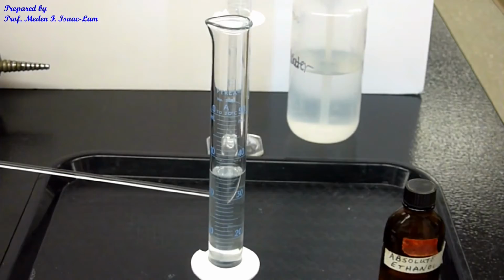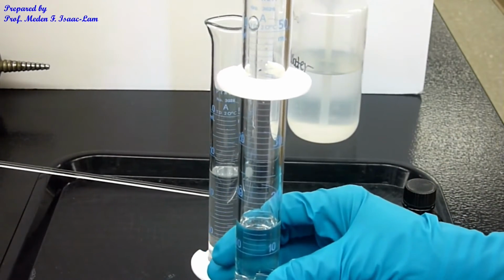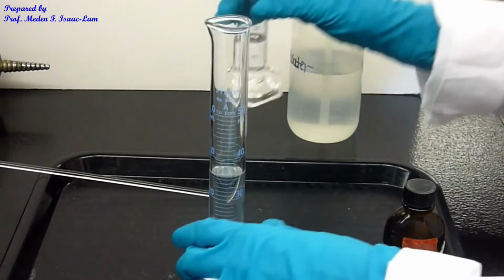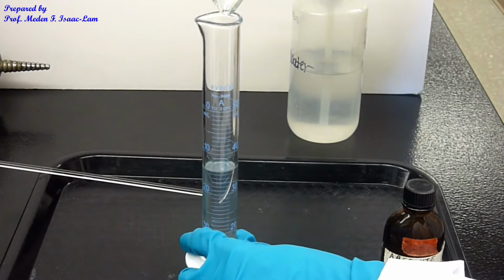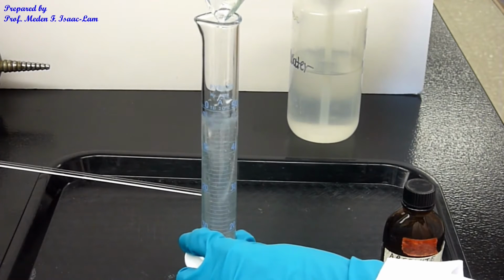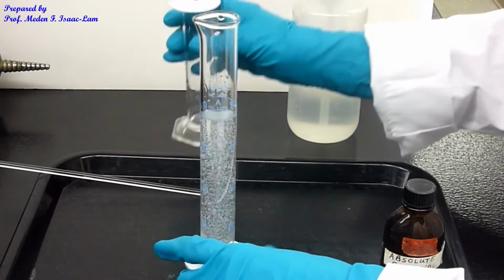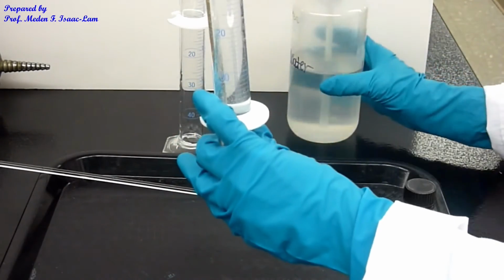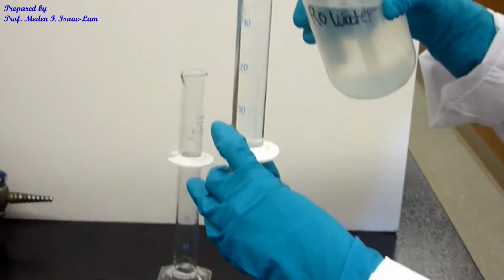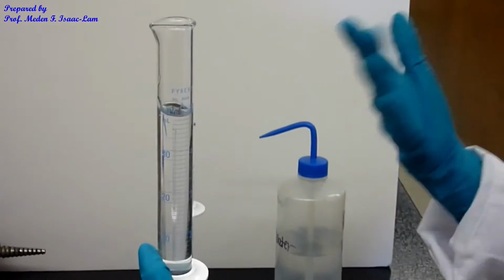And then I'm just going to mix 15 ml of water. So this is just RO water. So 15 ml of the RO water. I'm just going to mix it here. Basically I'm bringing the volume up to 50 ml, and I will add using the squirt bottle. Okay, so I'm mixing the two together.